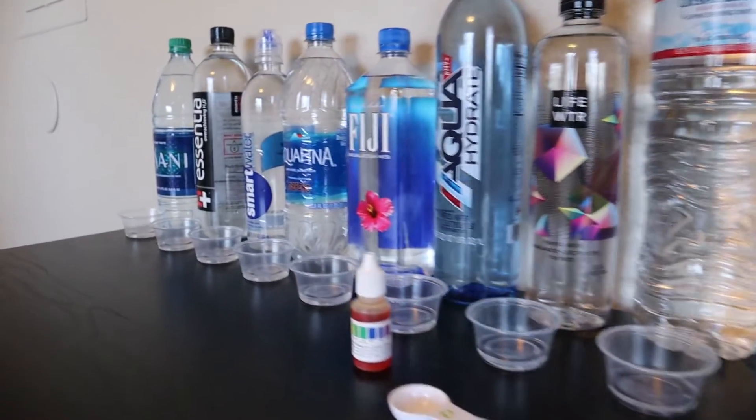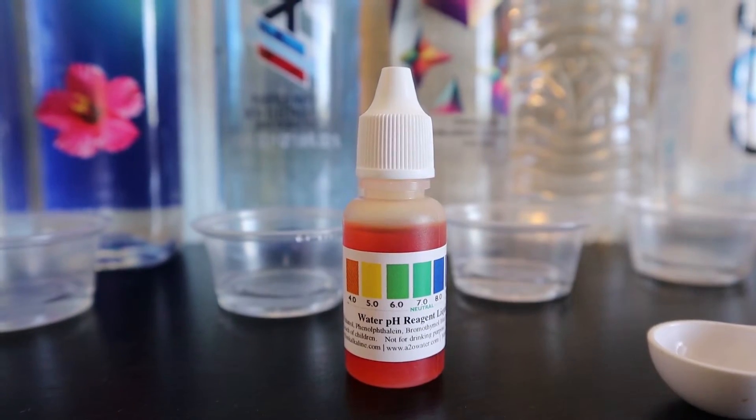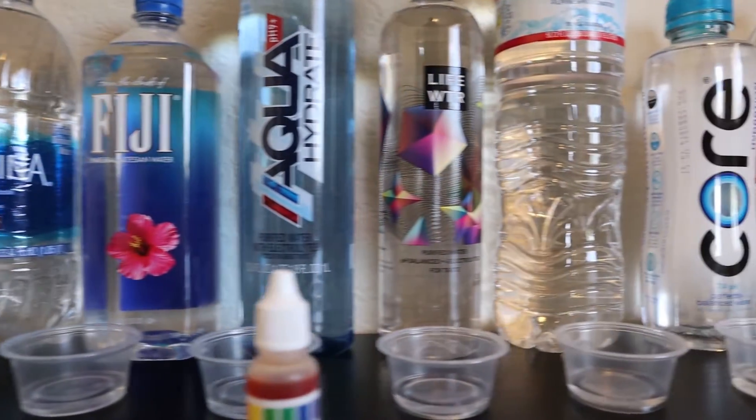I have 10 milliliters, otherwise 2 teaspoons of each water poured into these plastic cups. I'll be dropping 3 drops of the pH reagent to see how acidic or alkaline the water becomes. So let's drop these in and see what we get.